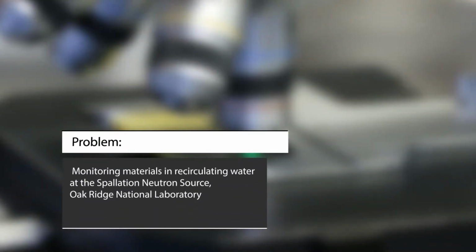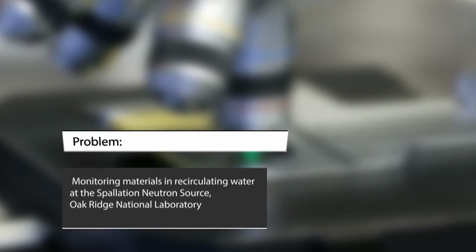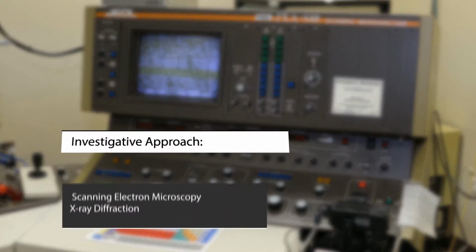About 2012, we were approached by Oak Ridge National Laboratory to consider a problem of monitoring the impurities or materials that were in the recirculating water cooling system for the SNS. There was a desire not only to monitor those impurities, but also to use the information gained from that monitoring to predict things that were happening in the system, perhaps a little bit like preventive maintenance, using a combination of scanning electron microscopy and X-ray diffraction.